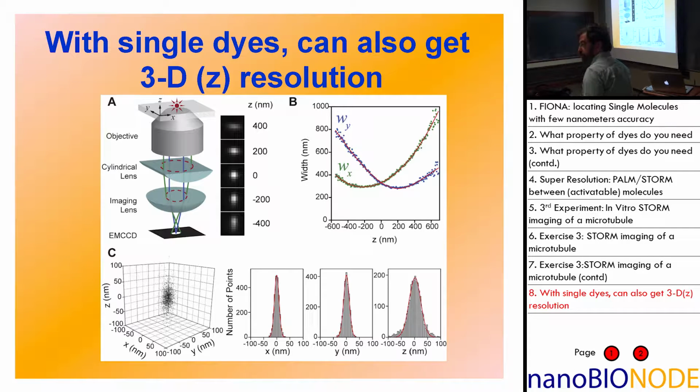Okay, there's two questions. There's how do you get the X and Y direction, and how do you get the Z direction, the magnitude of the Z? One side is long, the other one is short. So the greater the difference between them, the less in focus you are.